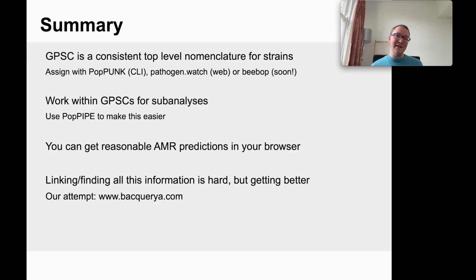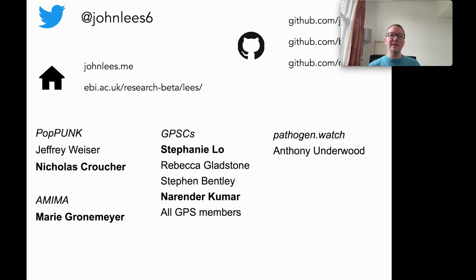And we want to put all of this information together. That is hard, but I think it's getting better. Our attempt at doing that is BacQuerya.